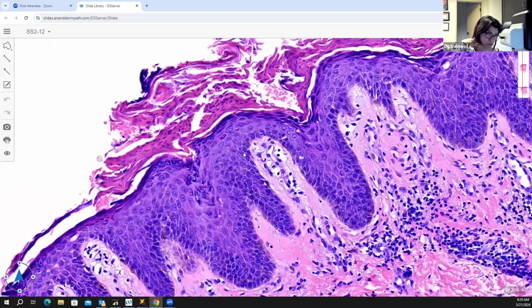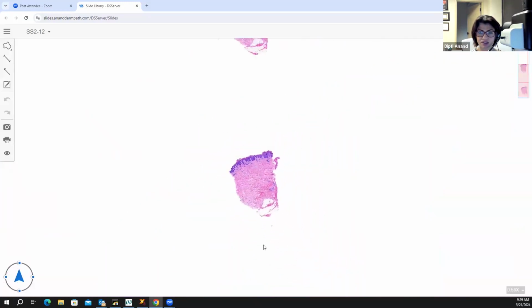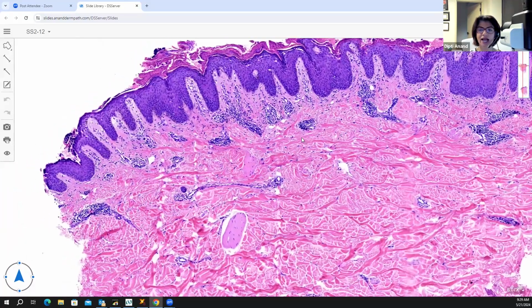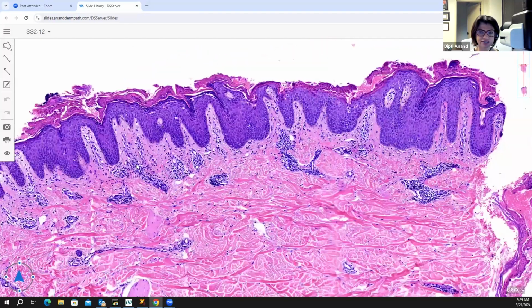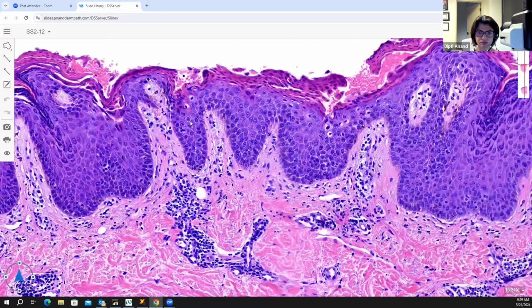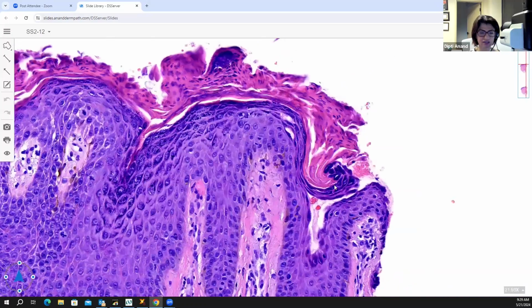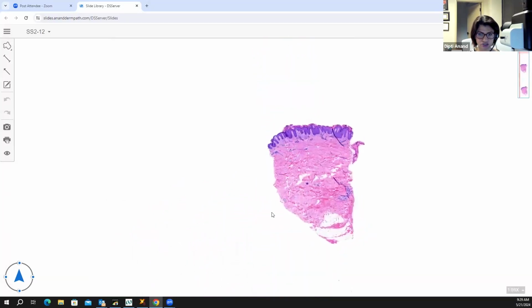So there is an acantholysis involving the superficial stratum spinosum and the granular cell layer. Okay. Subtle acantholysis. This is pemphigus foliaceus. And the way to describe pemphigus foliaceus, the blister can be very subtle, is that your granular cell layer will look weird. So when you look at it, there is something peculiar because there is acantholysis involved, so it becomes darker looking. And you can see here that the cells are like falling apart. Okay, yeah. So you can see here, the granular cell layer has kind of curled up because that's where the acantholysis is occurring. So this is pemphigus foliaceus.